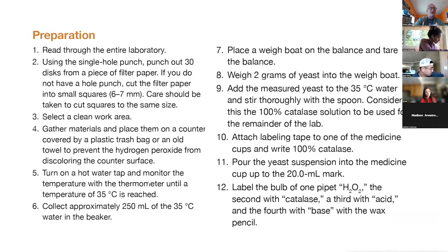So you want to punch out, if you have a single hole punch, which I really recommend you have, I luckily found one in my son's room, you want to punch out 30 discs from the filter paper that you're given.